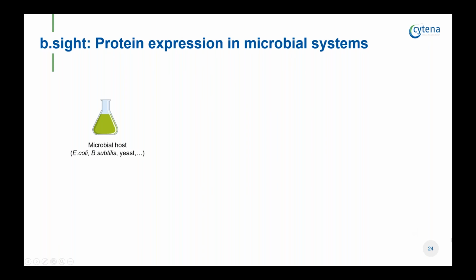Cloning of bacteria and yeast is somewhat a standard method in the repertoire of every micro or molecular biologist. It's very, very common to do that. And there are a lot of applications where cloning is required, also in a high throughput manner, for example, in synthetic biology, in antibody fragment screening, or for the expression of small proteins such as antigens.